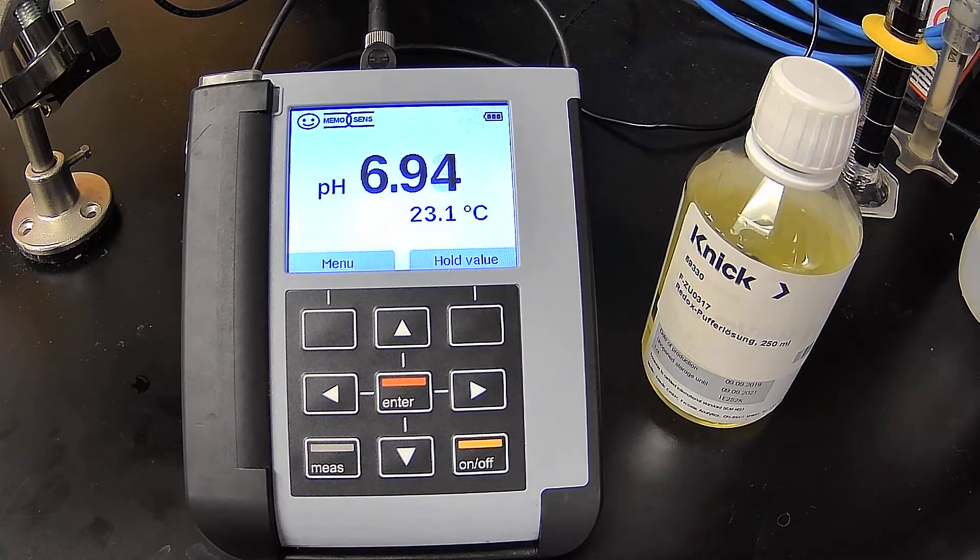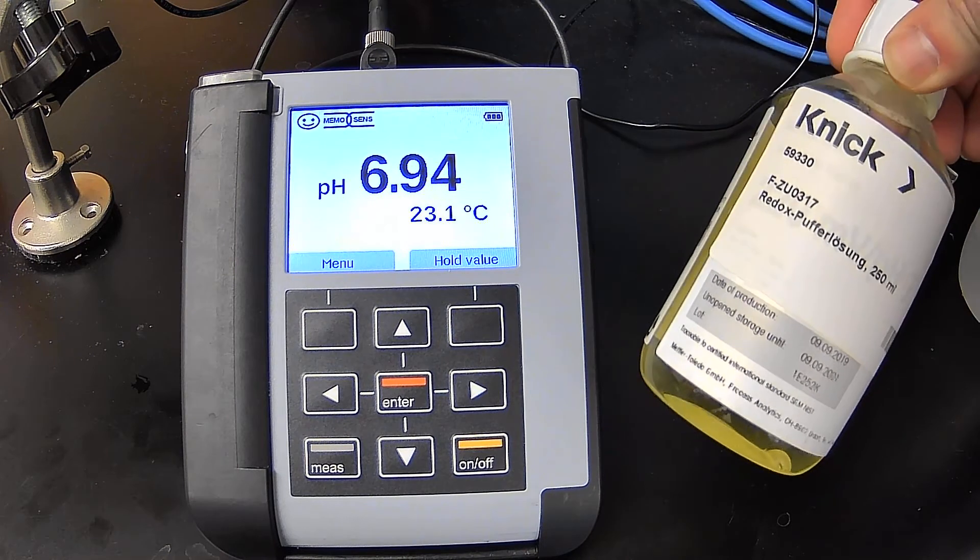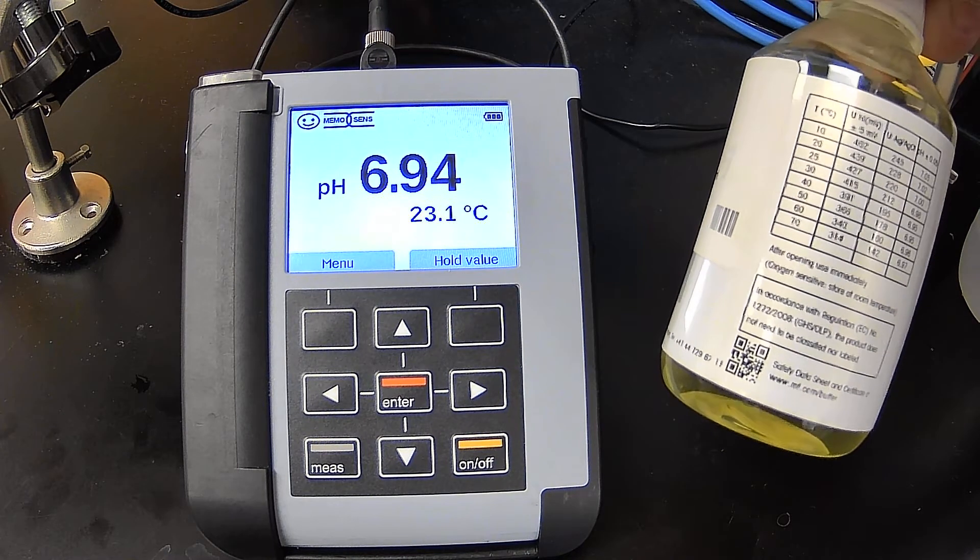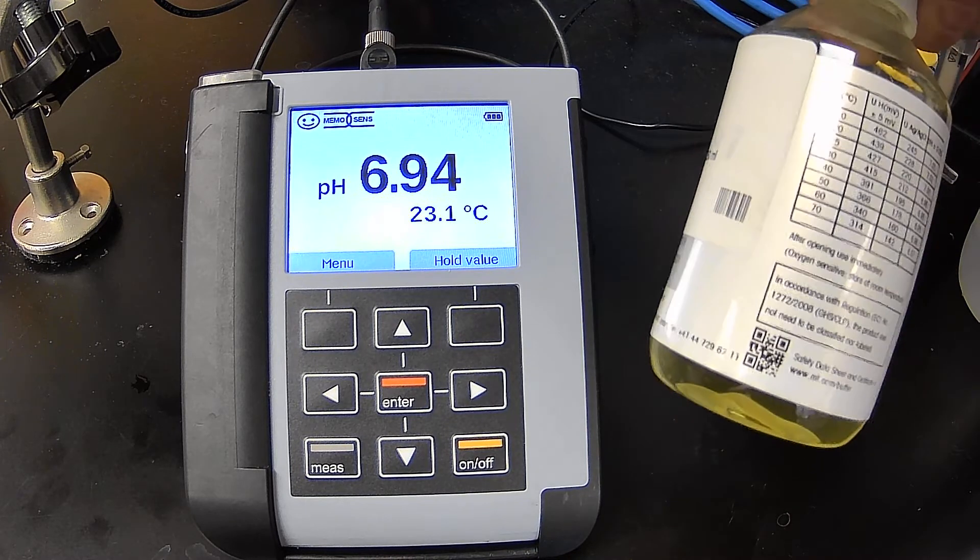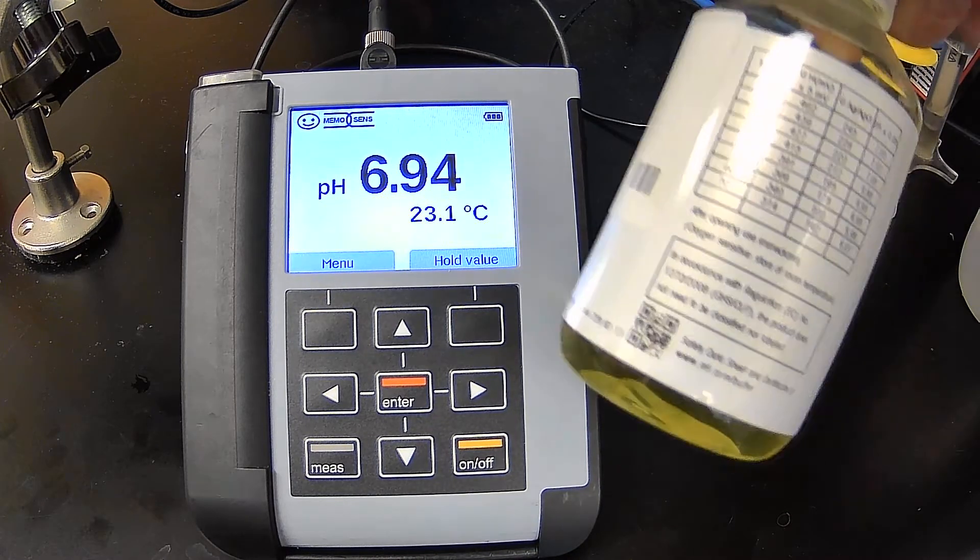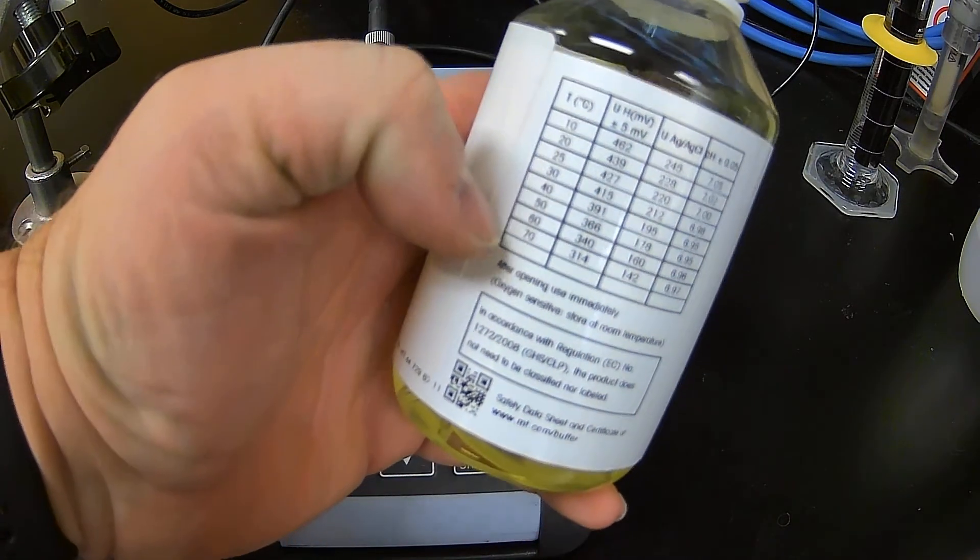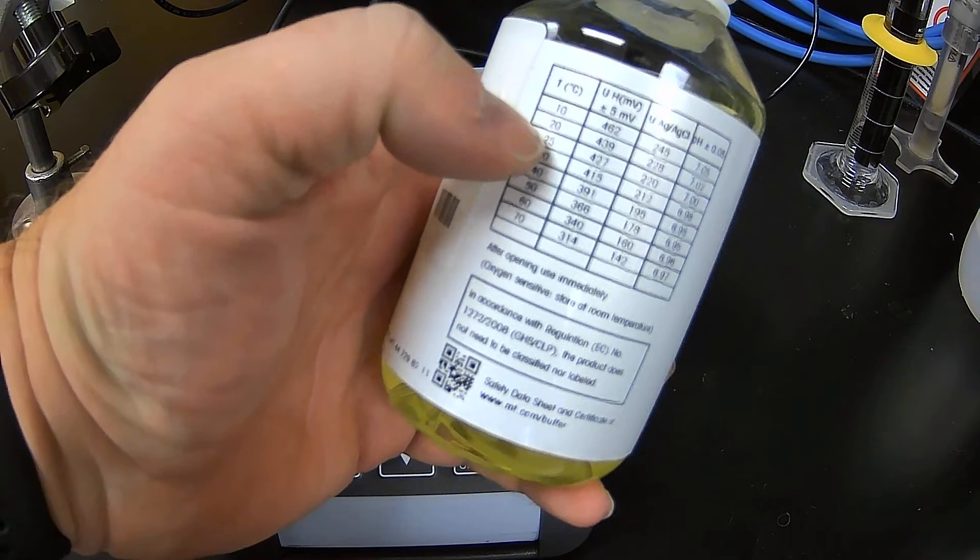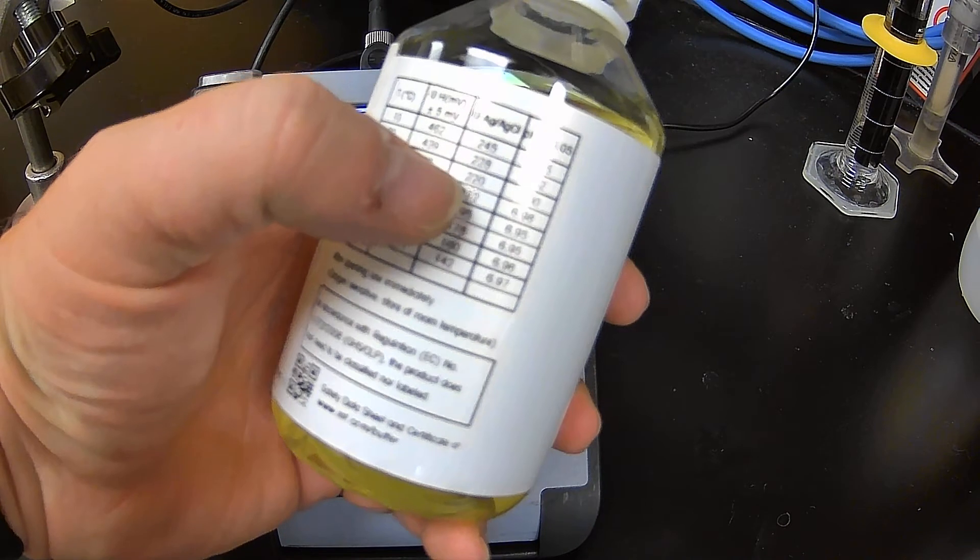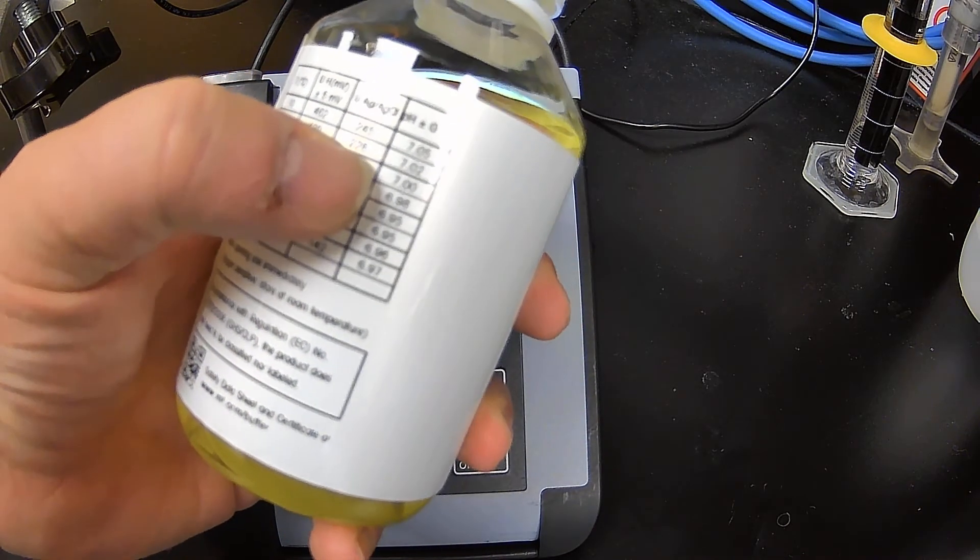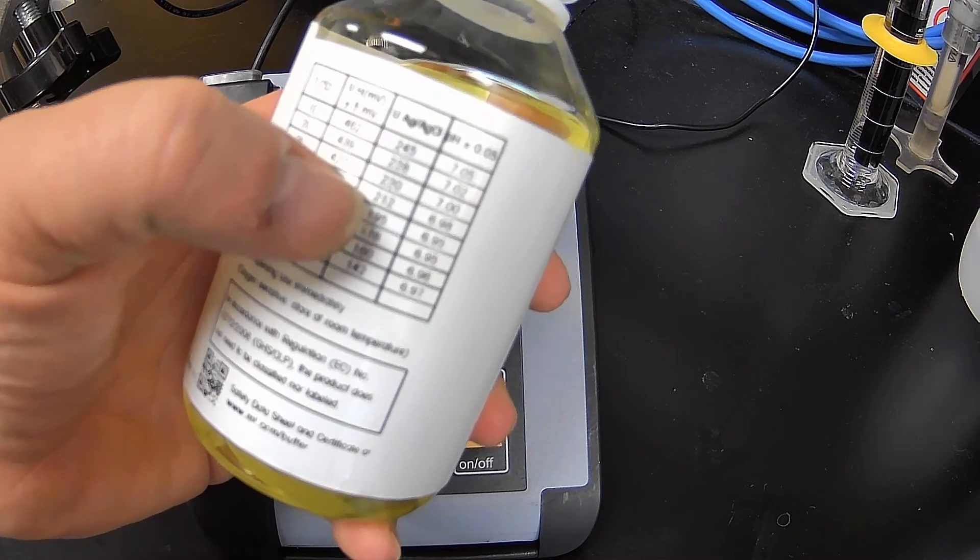Now, whenever you calibrate an ORP, you want to use a known standard so that you can get a proper calibration. In this case, we're using a 220 millivolt ORP standard at 25 degrees Celsius. Now I'm going to apologize because the glare is going to get in the way. But if you come to 25 degrees C, skip through this column just for a moment, come across the 220 millivolts at a pH of seven. And that's for silver silver chloride reference systems, which is exactly what we have here.